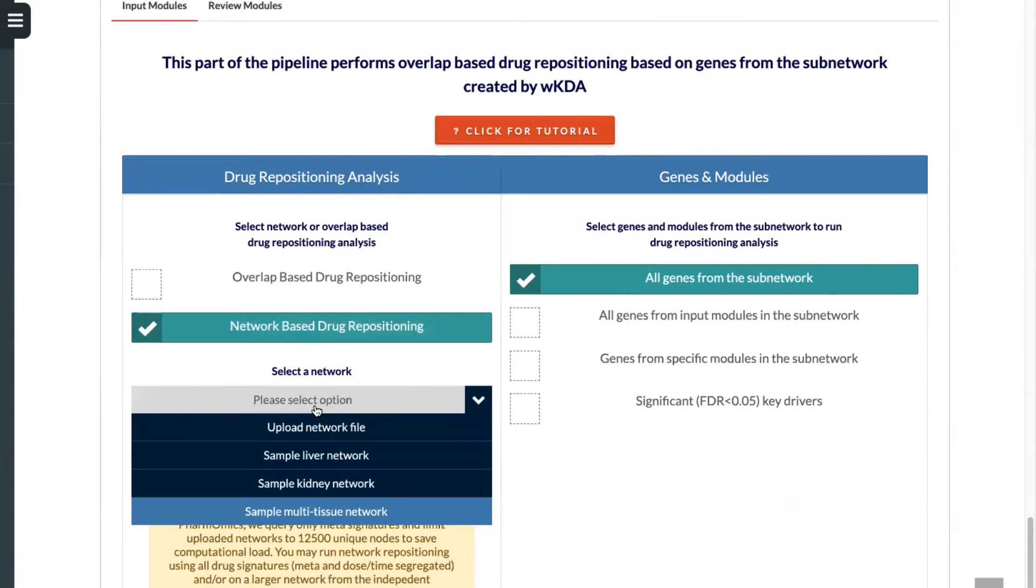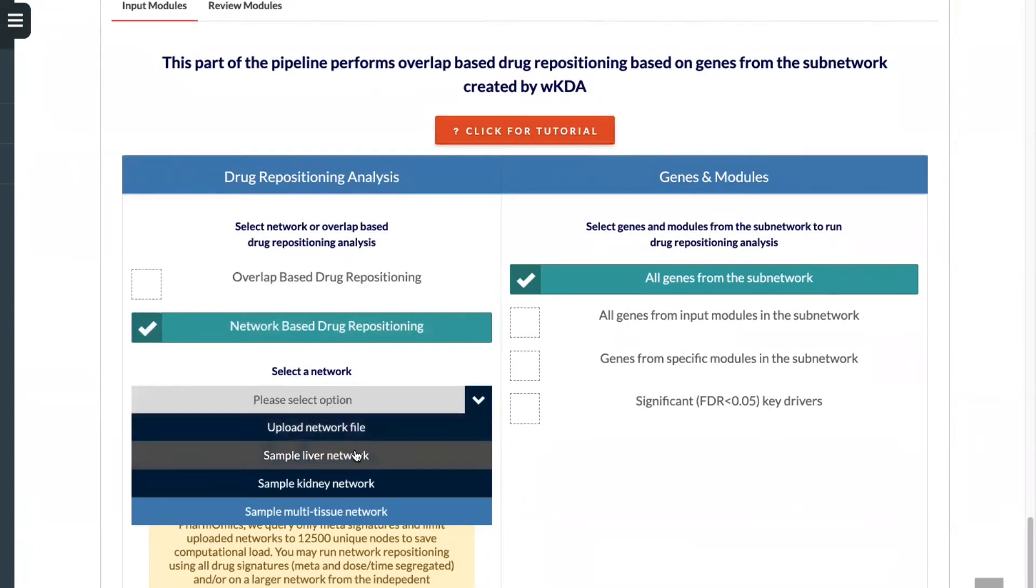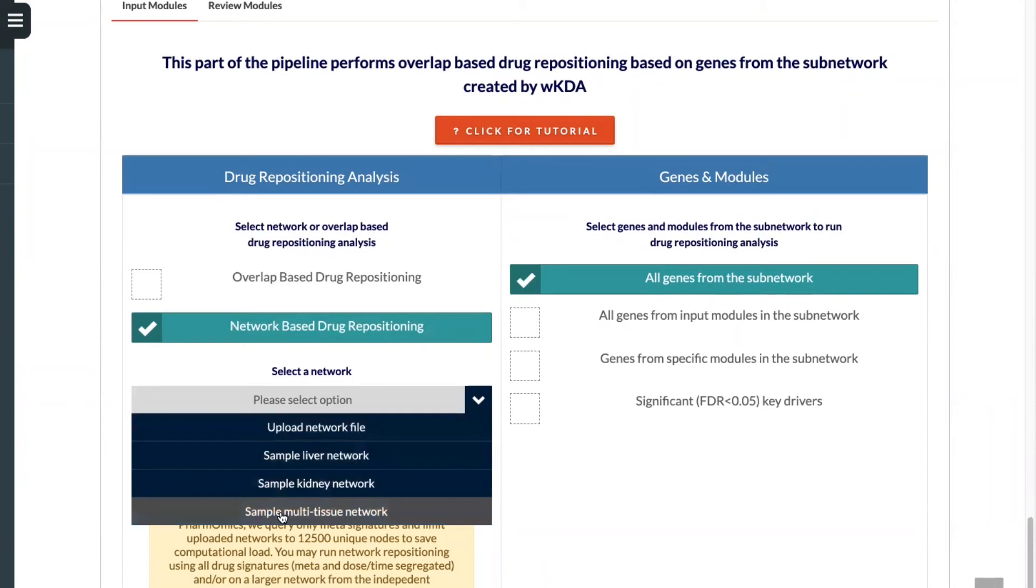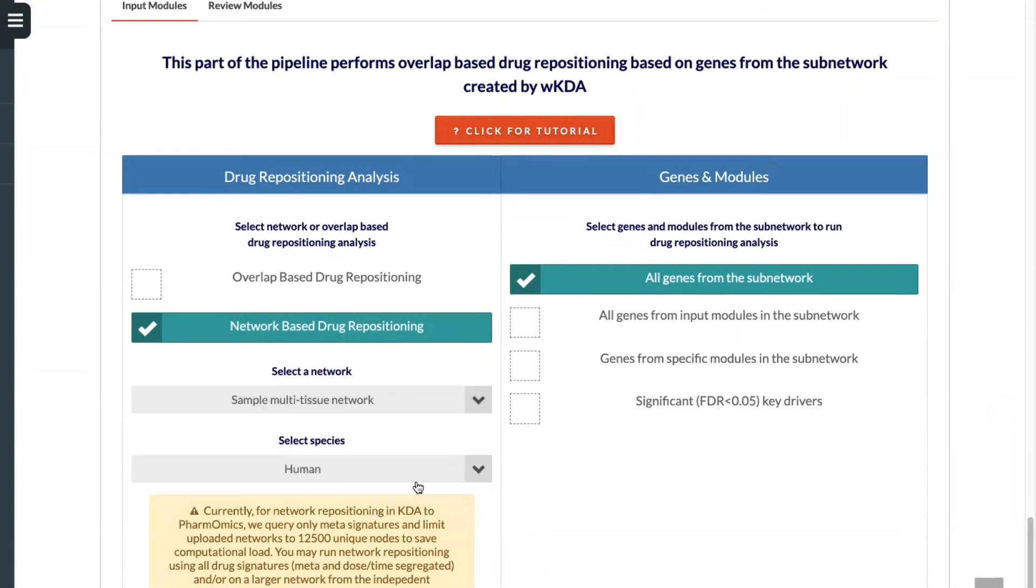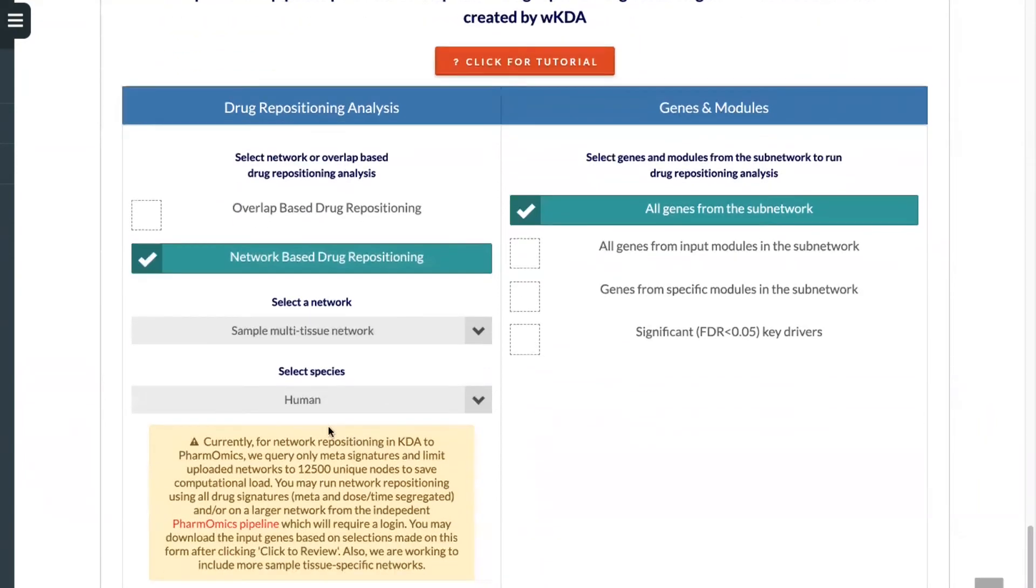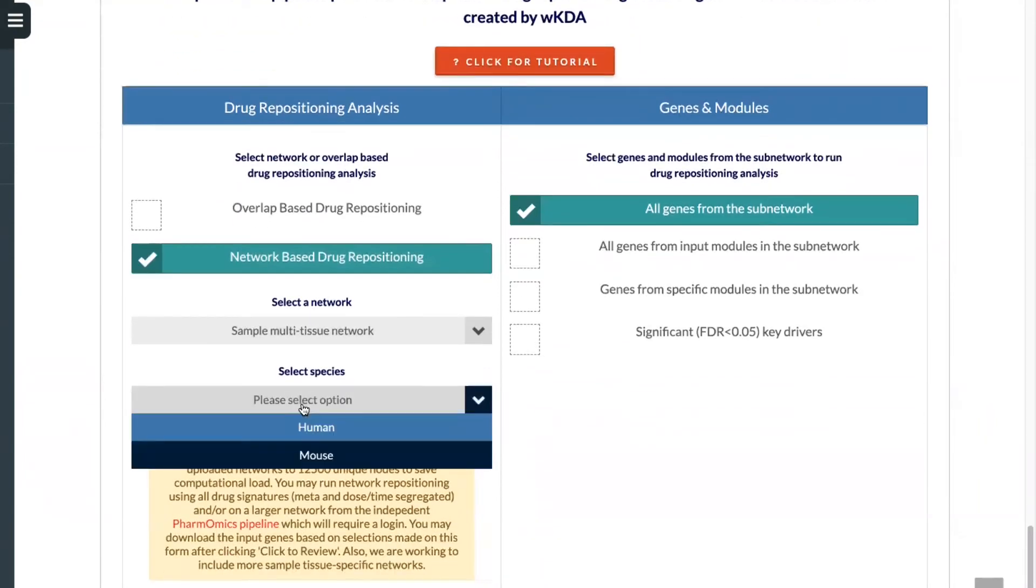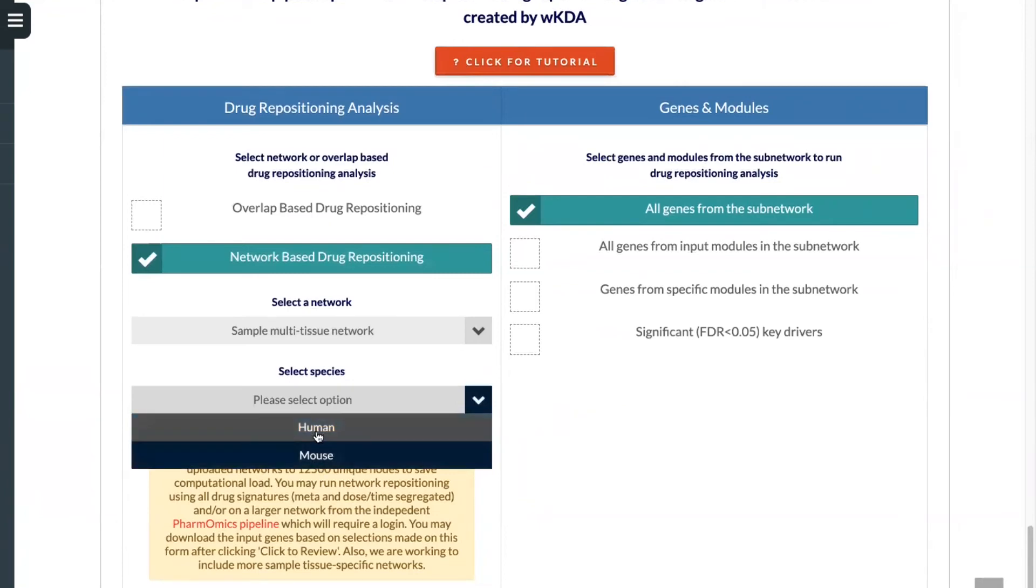Here, you'll be able to select a network or upload a network. In this case, we will use the sample multi-tissue network. We also have the option to choose from human or mouse. In this case, we will select human as our data is derived from humans.